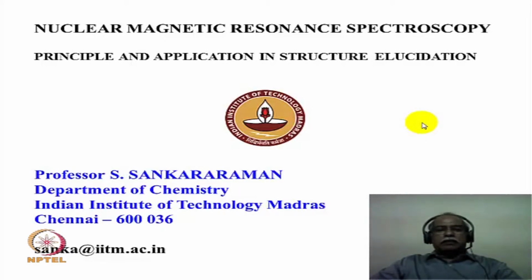Nuclear magnetic resonance spectroscopy is a very powerful tool. It is very widely used in the structure elucidation problem of organic, organometallic, and inorganic complexes. It is an indispensable tool in the chemistry laboratory. Whenever a student makes a new compound, he immediately rushes into the nuclear magnetic resonance spectroscopy laboratory to record the NMR spectrum. The wealth of information that one gets from the NMR spectrum is invaluable in structure solving problems.